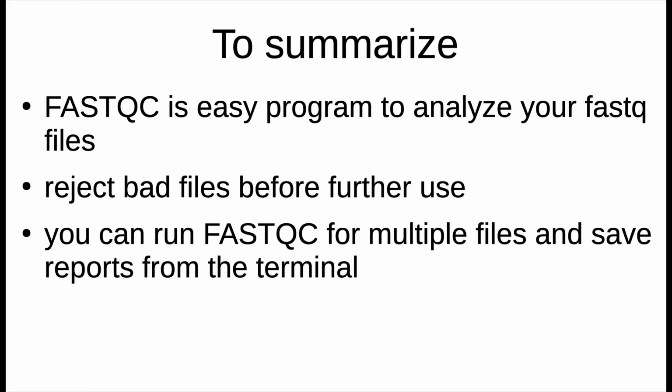Today we learned that fastqc can be run by everybody. It's a very easy program with a very understandable output. Then if you detect bad files, reject them immediately. Do not waste your time. And the third element is that fastqc can be run for multiple files in one push of a button from the command line in the terminal, and it will generate all the reports in a dedicated directory. So far so good, and thanks for being here.